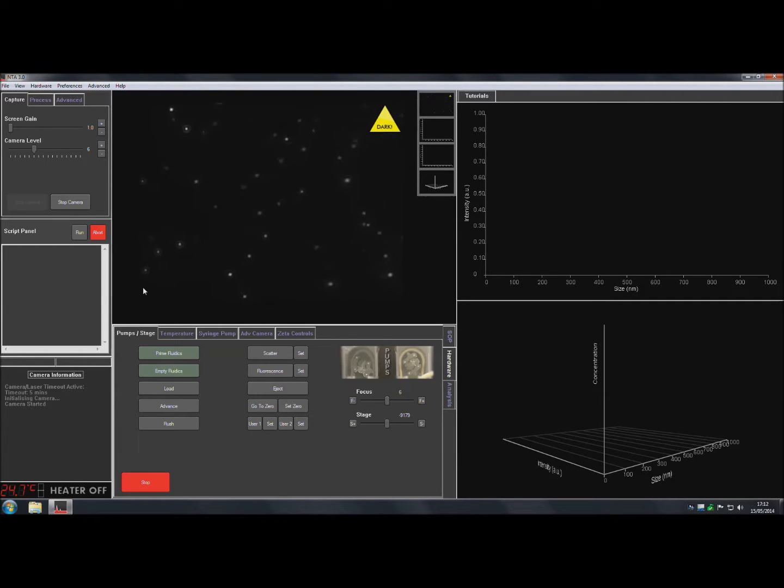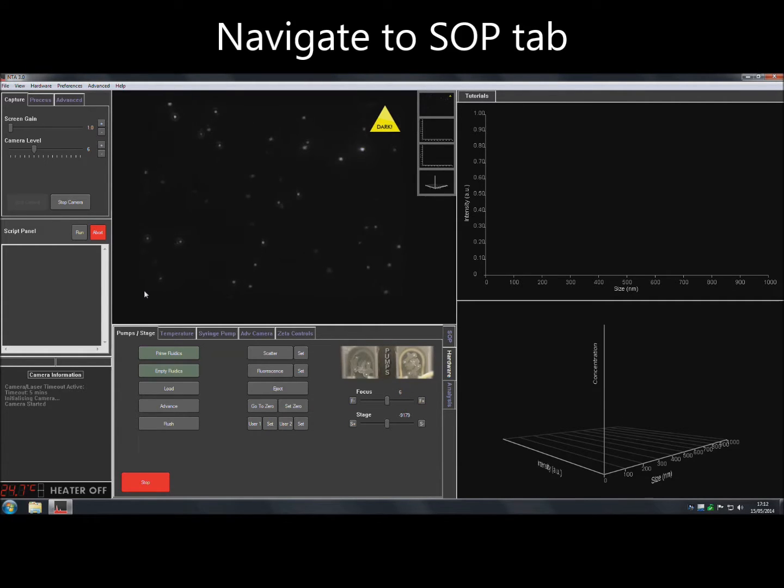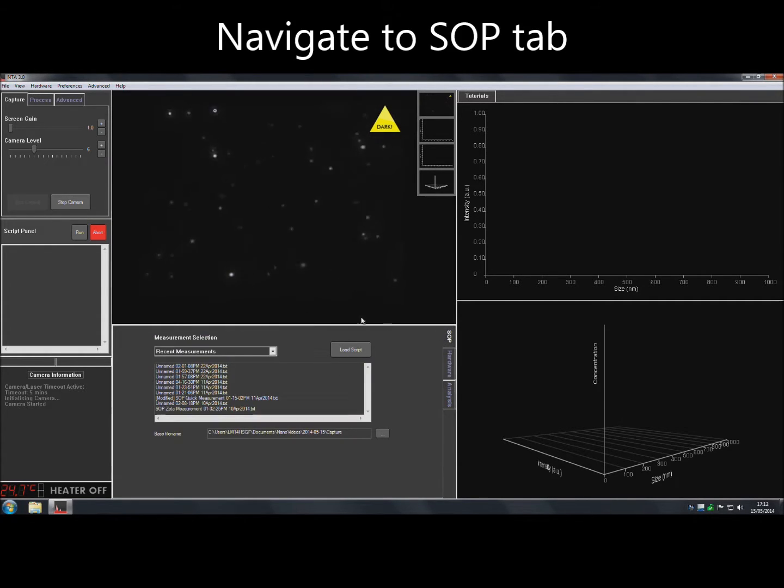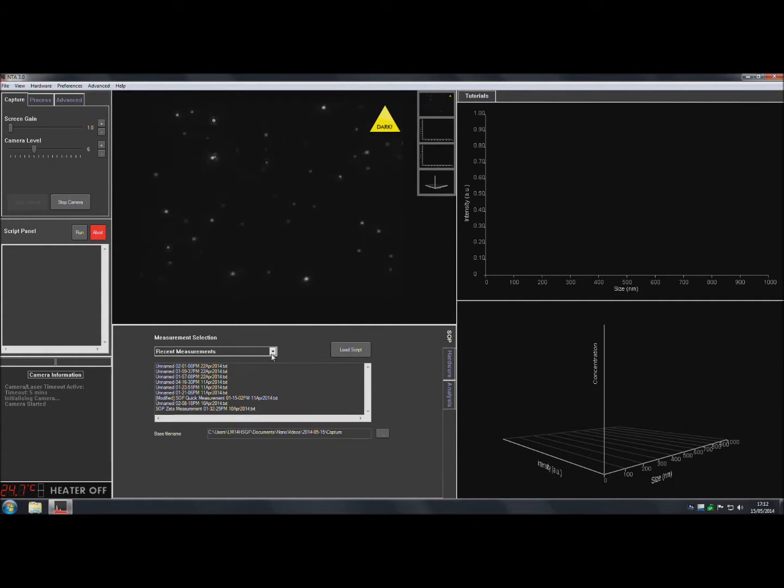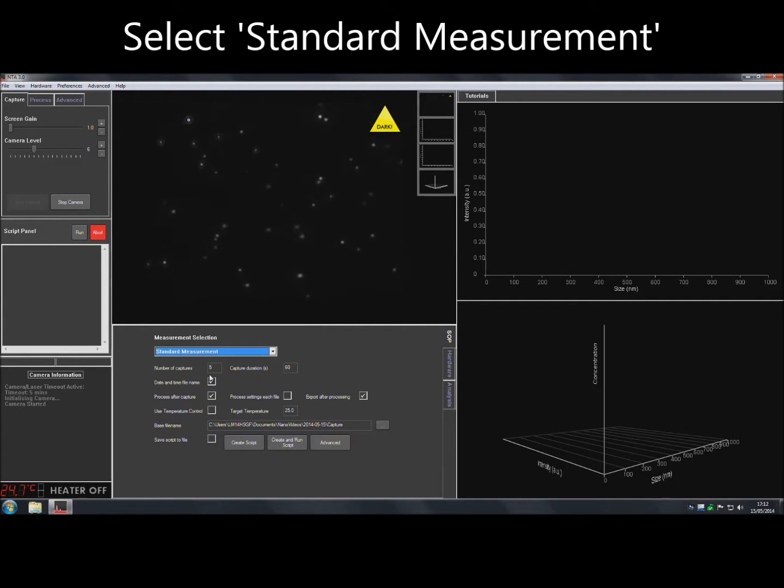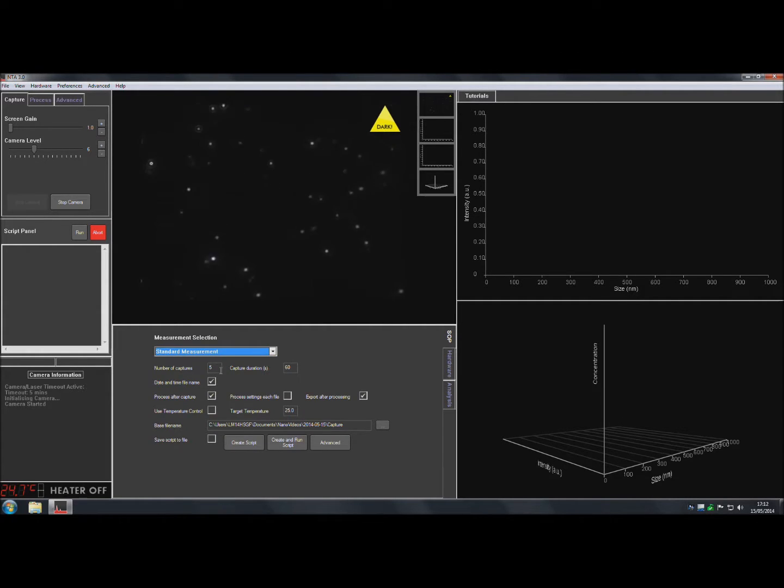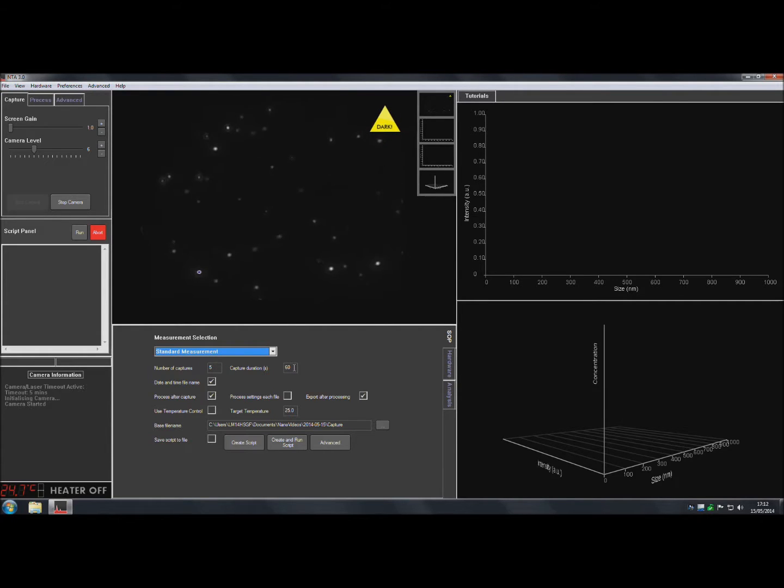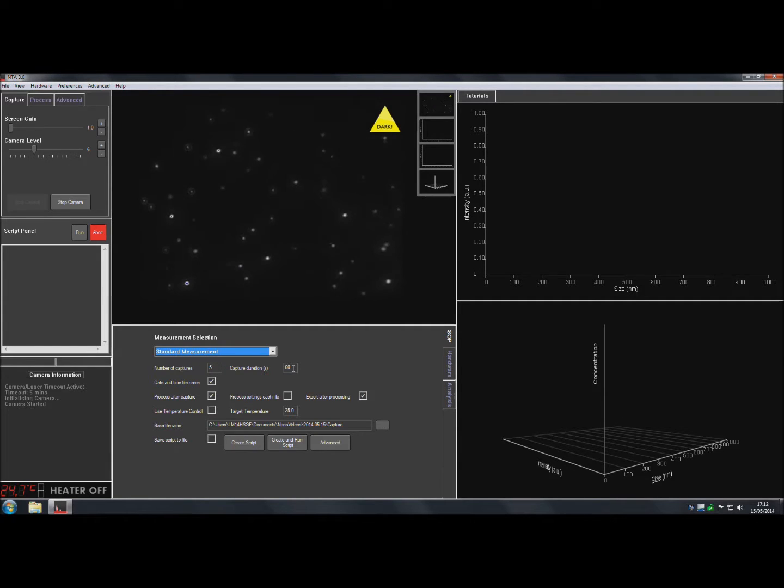Once happy with the image, to run a standard measurement, navigate to the SOP tab at the bottom of the screen and then select Standard Measurement from the drop-down menu. If changes to the default number and length of video captures is required, the values can be adjusted here.